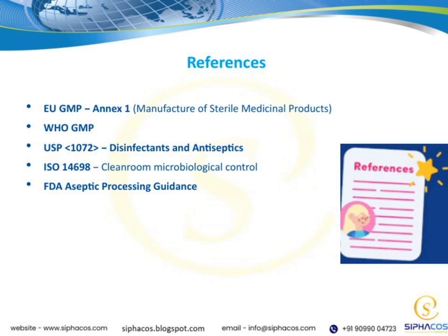Then there's USP 1072, which focuses on disinfectants and antiseptics. Proper use of these agents is critical for maintaining microbial control on surfaces and equipment, ensuring product safety. ISO 14698 is another important standard that deals with microbiological control in cleanrooms. It guides us on monitoring and controlling microbial contamination in controlled environments, which is fundamental to aseptic processing.